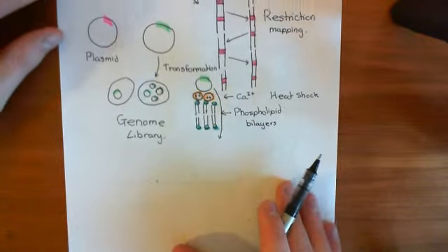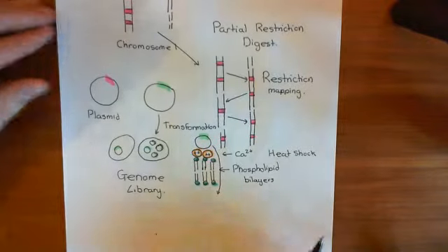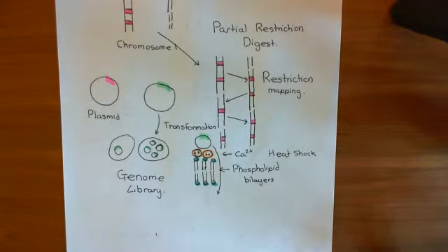So just to recap, what we are trying to do, remember, is we are trying to sequence the organic base sequence of chromosome 1 to 23. We cannot just perform Sanger sequencing on an entire chromosome. They are too big. So instead what we have to do is we have to fragment it down into small pieces. The problem then occurs, is how do we put the pieces back together?